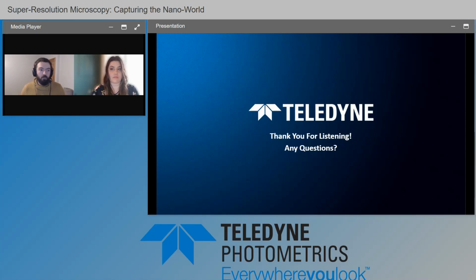But does that change what the image is like compared to how the sample is? You can't be sure because the information on what the sample is like is coming from the microscope. So there's definitely a lot of caveats to consider when you're using super resolution, but because there's so many different ways to do it now, I'm certain that there are some systems which are suitable for everyone, and then everyone gets to benefit from the advantages of seeing samples they couldn't see before.